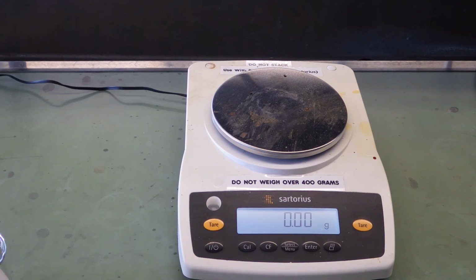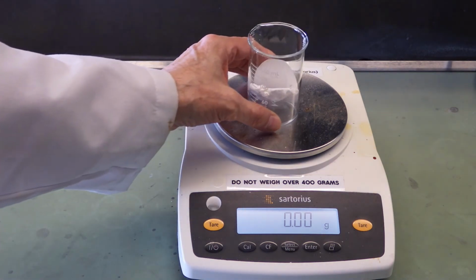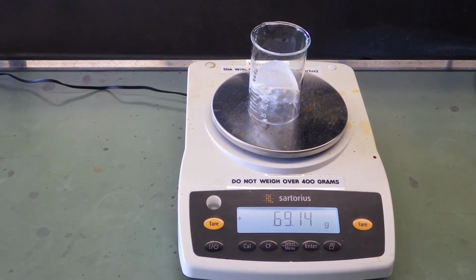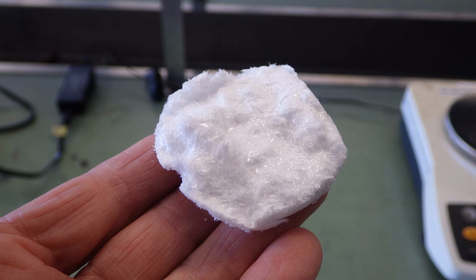So here, the final mass of our dried product. You want to record this, 69.14 grams. Here's the final product. It looks clean, white, crystals are well formed. It certainly looks pure. So the last step of our experiment is to go back to the procedure, look at how to record your data and results and do your calculations.